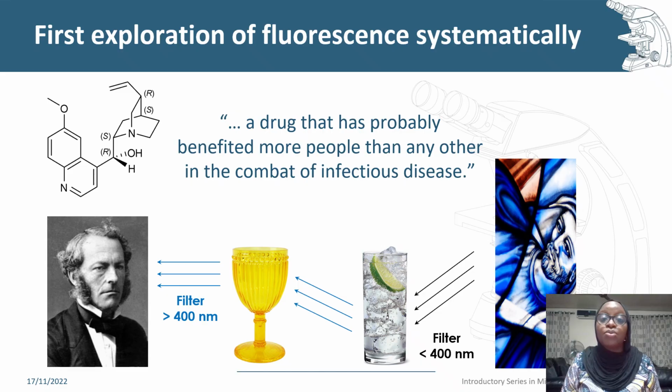Tonic water was used, and a colored goblet was also used to allow light to pass through. In this way, he isolated the blue color associated with quinine.